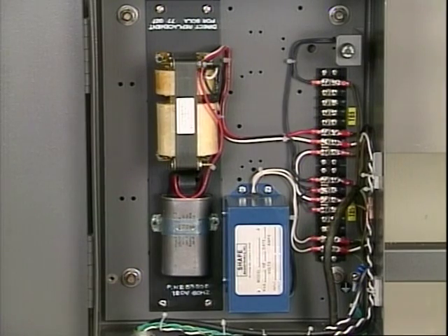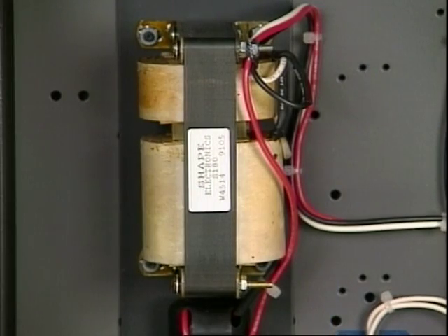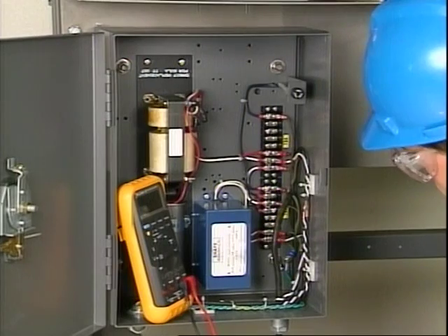This analyzer is equipped with a combination ballast and lamp transformer. If the output voltage is not correct, you'll need to de-energize the analyzer and isolate the faulty component by taking resistance readings to determine if the problem is with the transformer or the ballast. Replace the ballast if it's found to be faulty. If the transformer is the source of the problem, replace it.